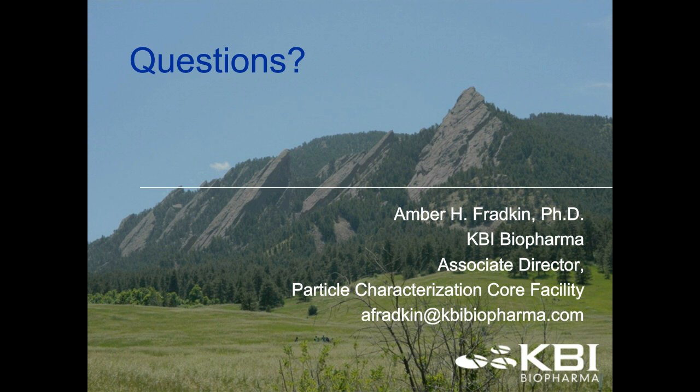Great, thank you very much. Another question here for you. Someone says, at what stage in development of a drug do you recommend starting particle monitoring?